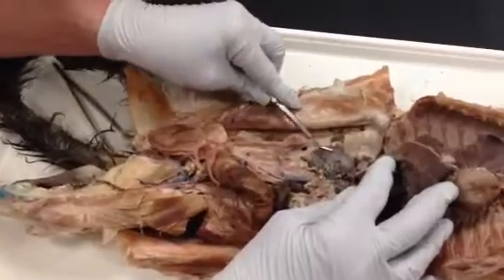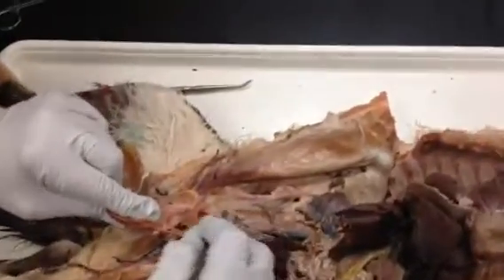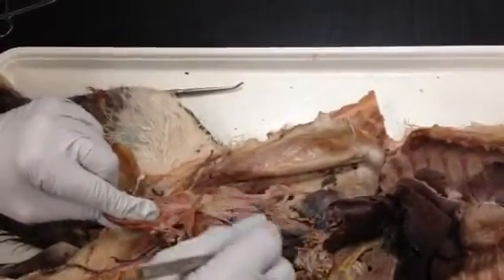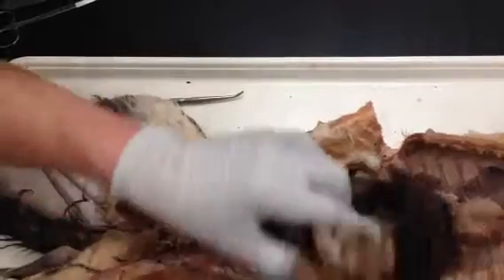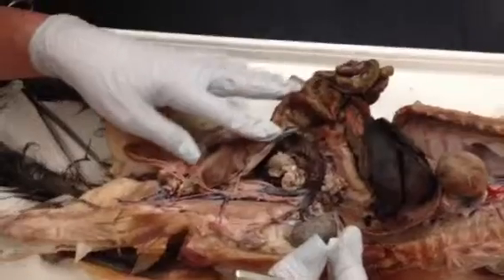Then we've got our kidney. If we pull on the bladder, we'll be able to see the ureter stand up. There's only one ureter on one side. I don't think we've got it on the other side. The other side has been cut, so we're not going to be able to see it.